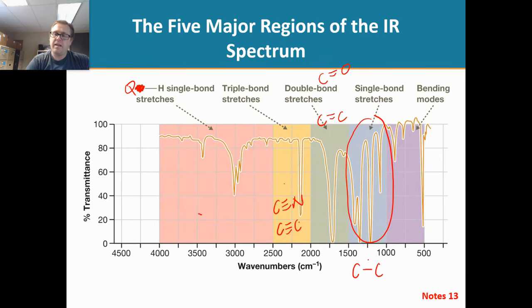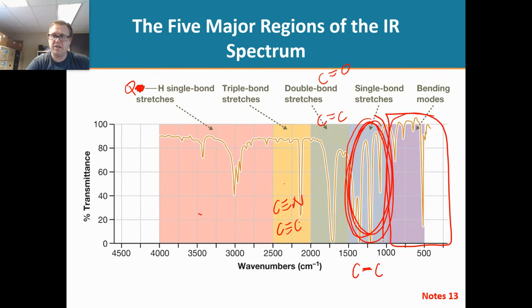That region right there, I don't focus too much attention on. And I definitely don't focus any attention over there, because that's in the fingerprint region.